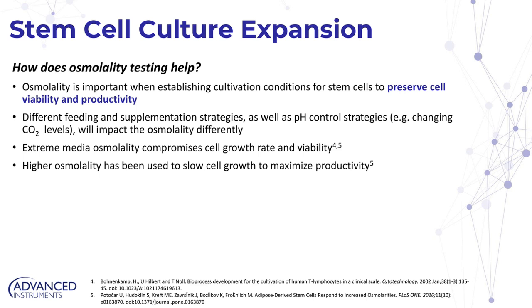And if we focus specifically on the expansion of different types of stem cells, we see the same value across cell sources even. So not everything that we find is testing the same type or source of cell in the body, but we have seen some of these general trends that I mentioned here on the slide.